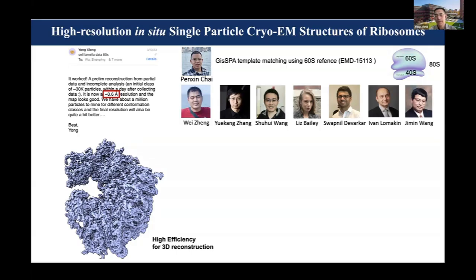This method depends on a reference, meaning an available template, a prior reconstruction. You have some information already, it can be at a very low resolution, but you need a starting reference. That could be a problem, right? Those in the field long enough know model bias is always a concern: if you don't see things clearly, you can interpret your result or bias it against your reference very easily.